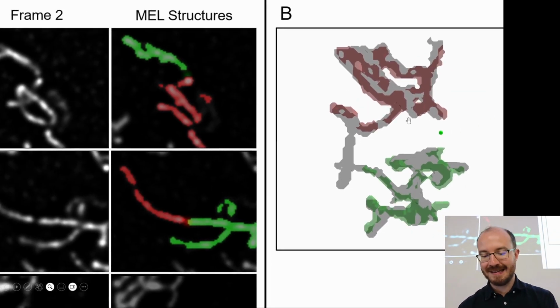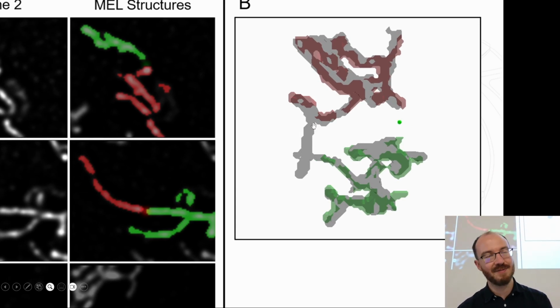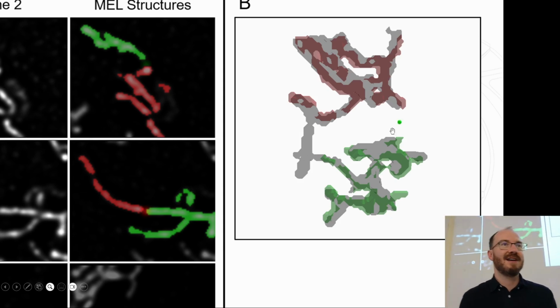Great, good assumption. Except if something like this happens. Now this was the closest point between the structures, so I said, there's the event, where in reality it fused to a third structure, and there should have been two events. So I missed one event, first of all, and secondly, I put the location in the completely incorrect place, because I just didn't think that this might ever happen.